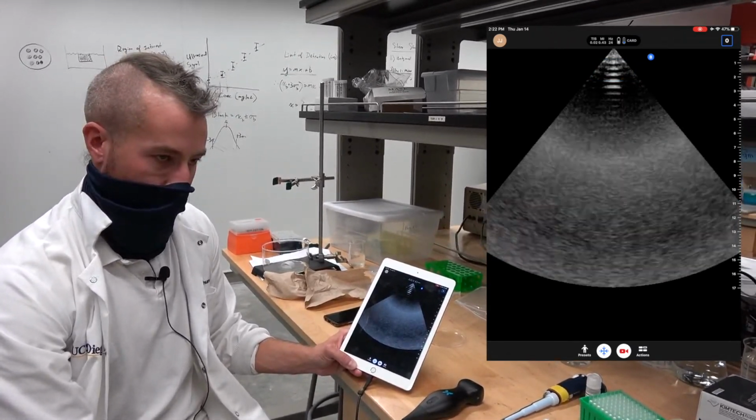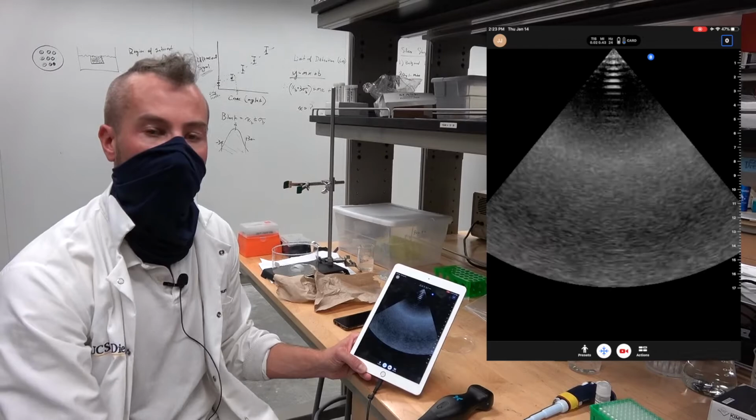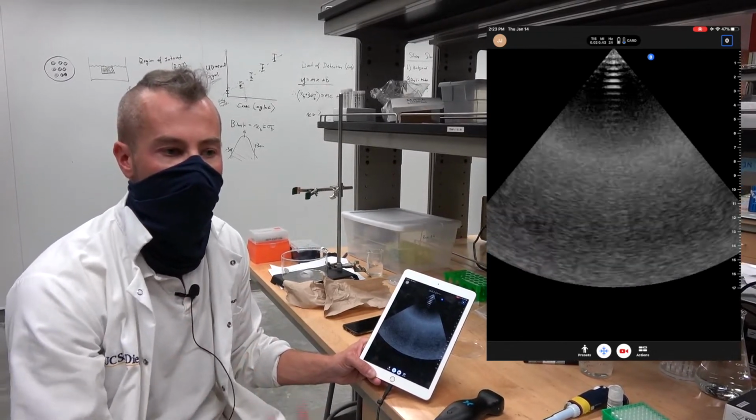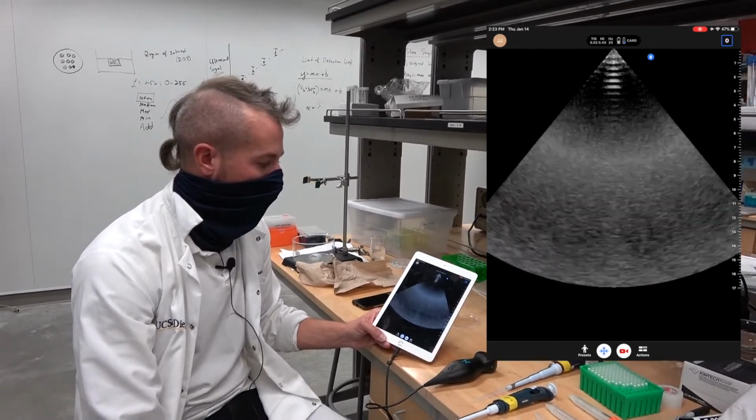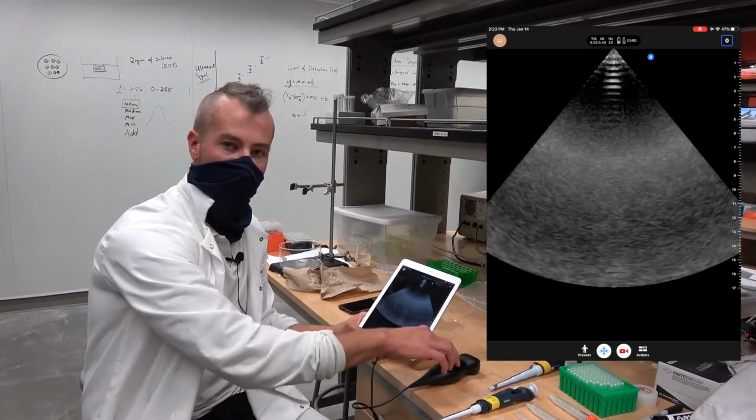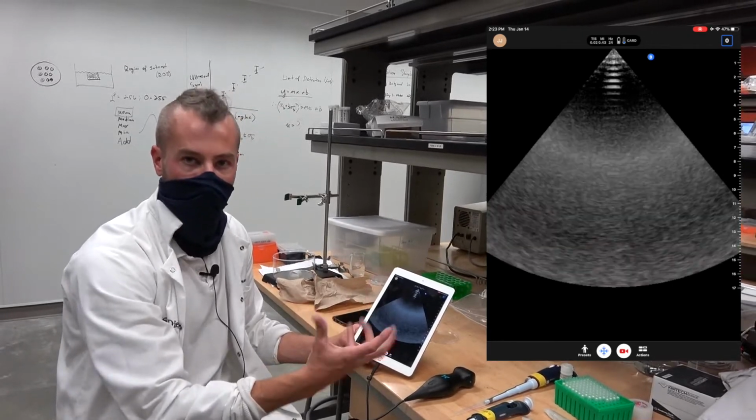And you remember from our discussion with the spectrophotometer that gain is just the additional potential that is put across the detector. So the exact same amount of initial stimulus is creating more signal here.